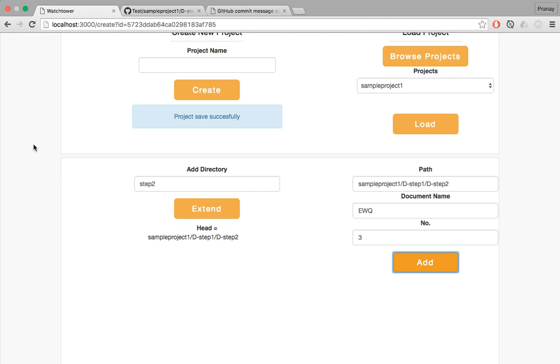It also solves a very big problem in that it creates any number of files for you at a go. So I can do 50 files if I want to, because I have 50 different samples, and it'll do that. All I have to do is just go in and edit the ones I really want to track.